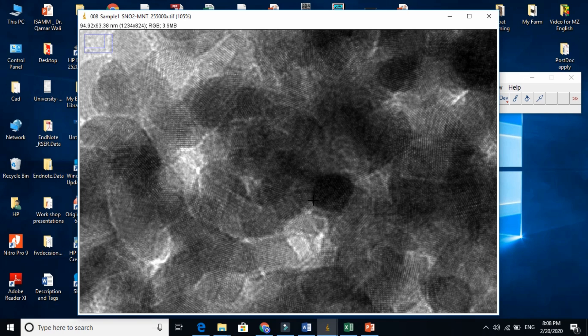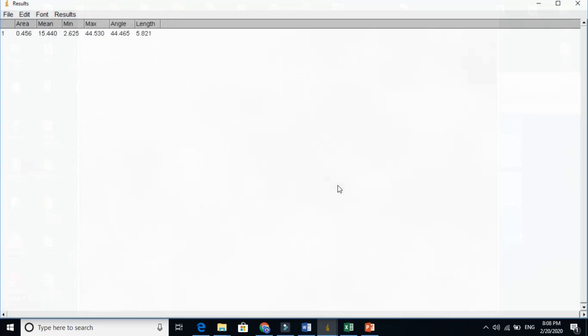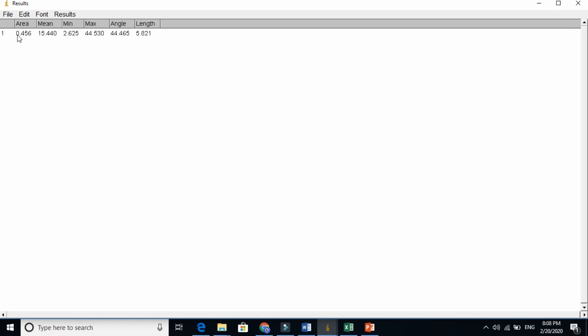Shift and draw this line here. And press control M here. It will show us the area here, you see, in the length. This is 5.8 nanometer.